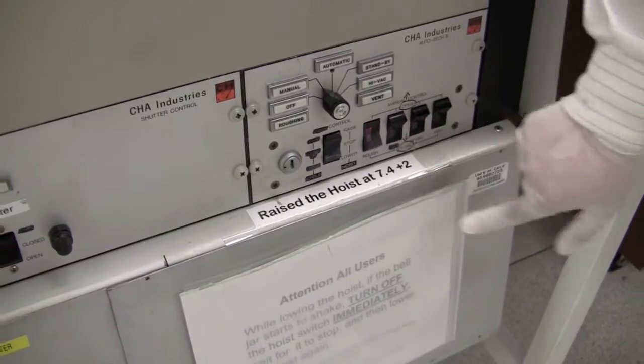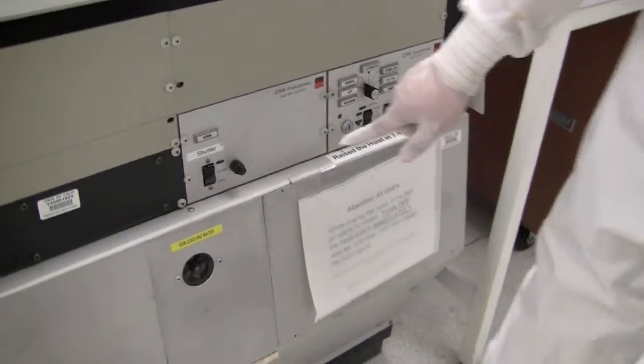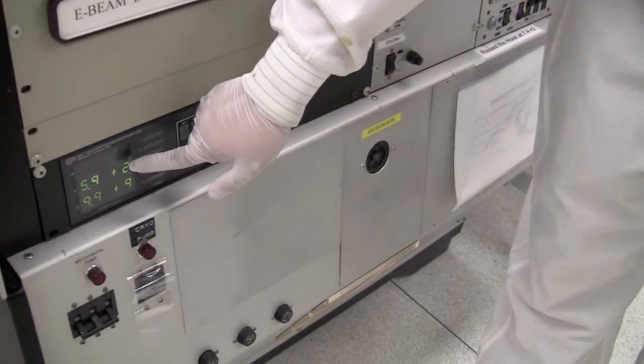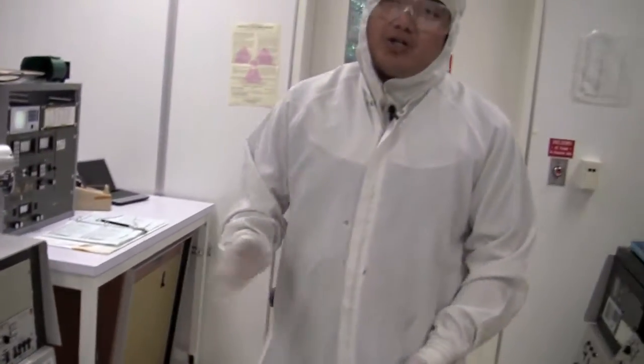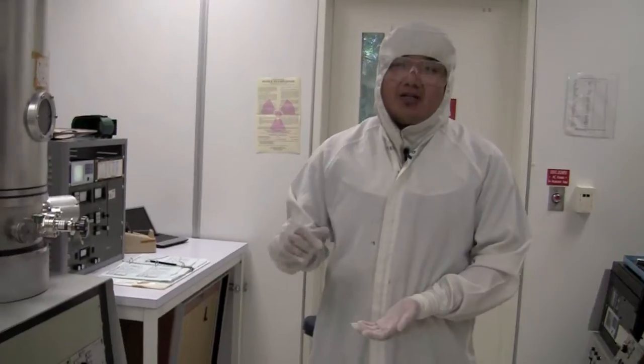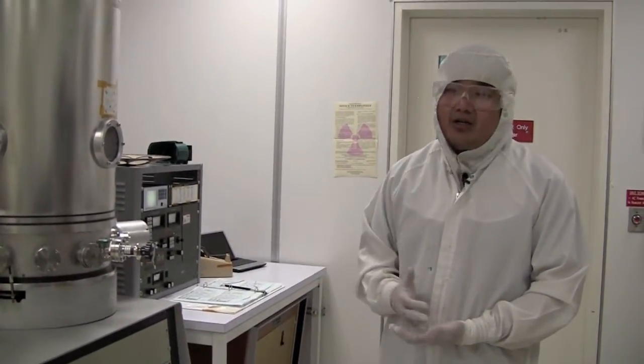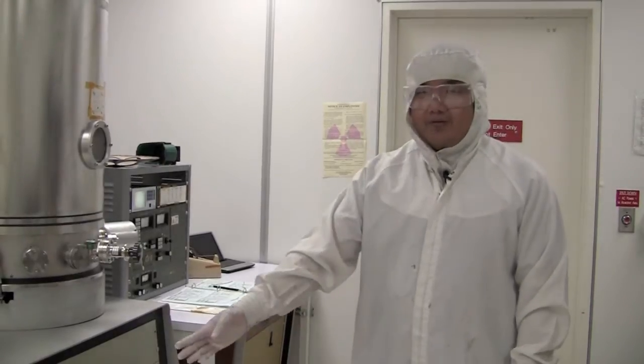We just turn it on, make sure the high vac and the vent is off. So we turn the roughing on and you should see the pressure decrease. We want to make sure that the pressure is less than 7 times 10 to the minus 2 before we turn the high vac on, but you can go a little even lower than that. So we'll wait a little bit for the pressure to drop.